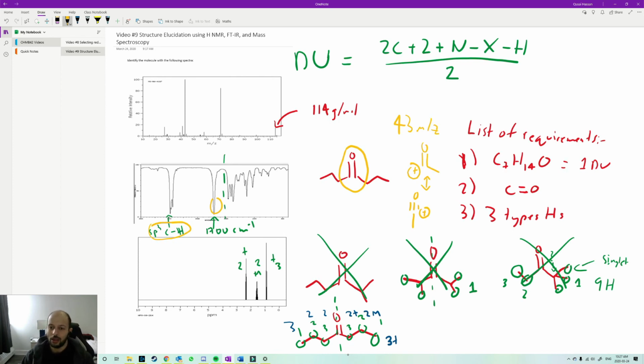So that is usually why, if you see 43 at a base peak, I usually go there straight away. The problem is, if I look at my template compound, I don't have one. For me to have an acylium ion, I need a compound that looks like this, with a terminal CH3, because that's the only way I could see an acylium ion.